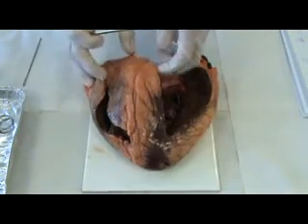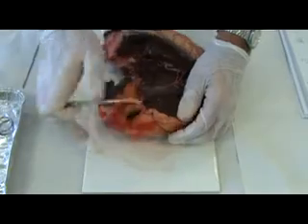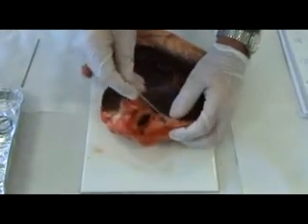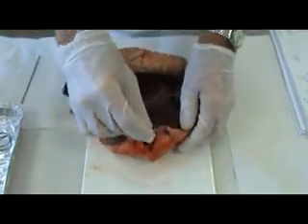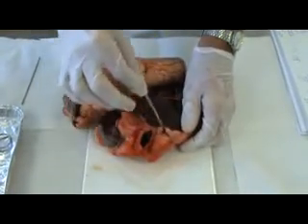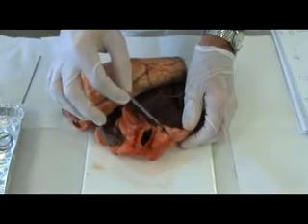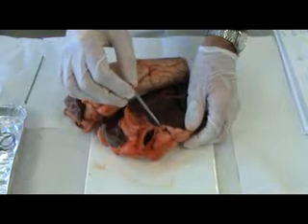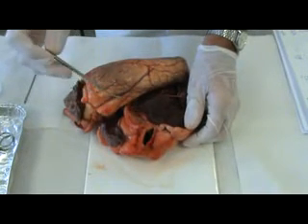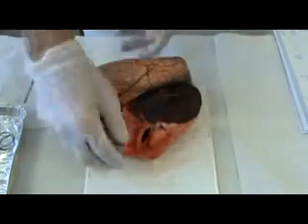If we turn the dissected surface over, with the probe placed in there, we can see a branch of the great cardiac vein. So the coronaries are supplying oxygen and nutrients to the heart, and the vein is carrying away waste products.